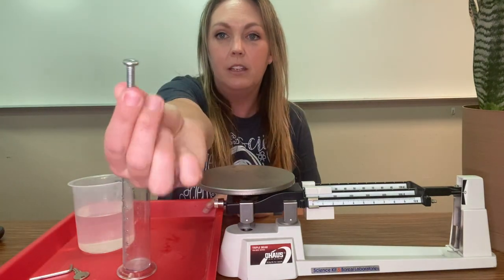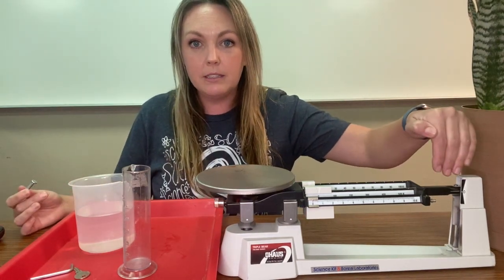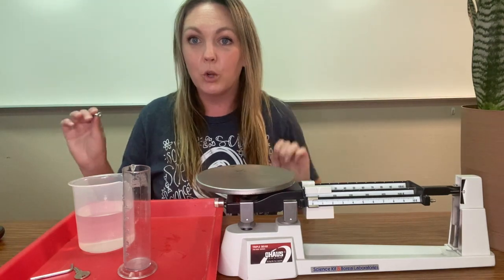First one is a screw. What you want to do is make sure that your triple beam balance measures out at zero. Right here, this little line is going to match up with this little line. We're good — it's perfect.